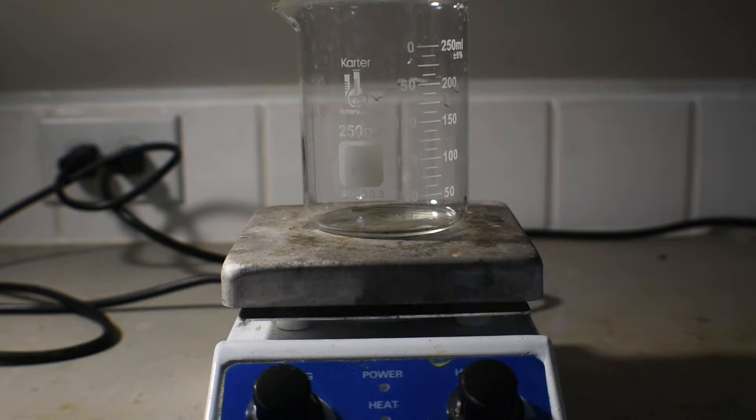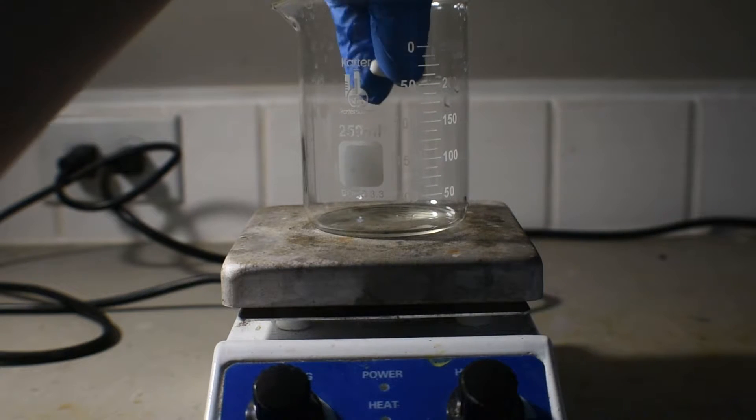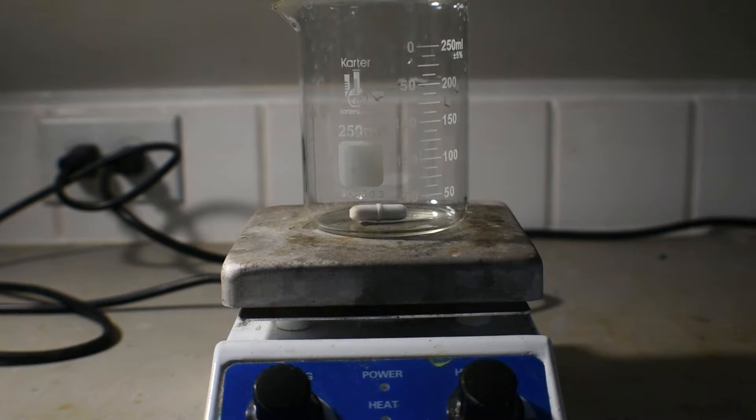First, I'm going to take a 250 milliliter beaker and add a stir bar. Now, I'm going to add the 12 grams of cobalt(II) chloride hexahydrate.